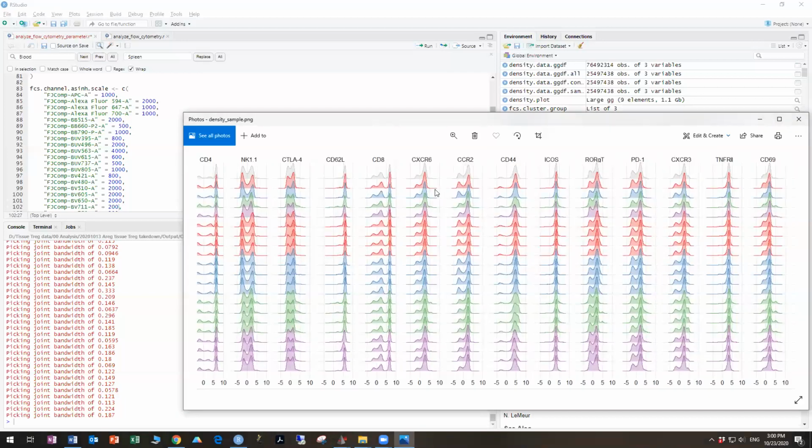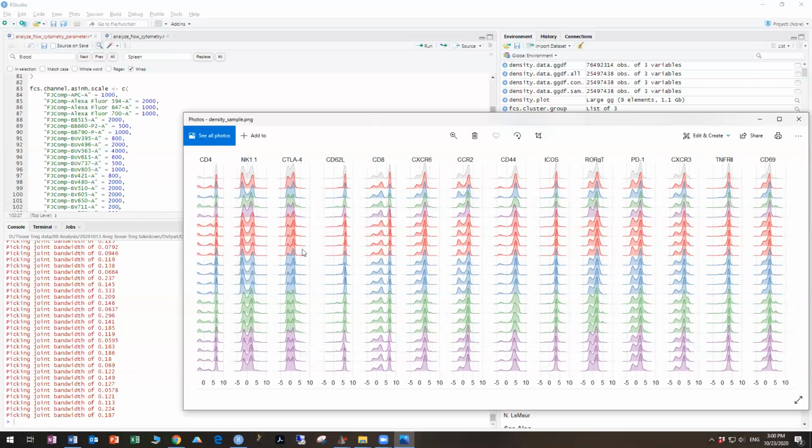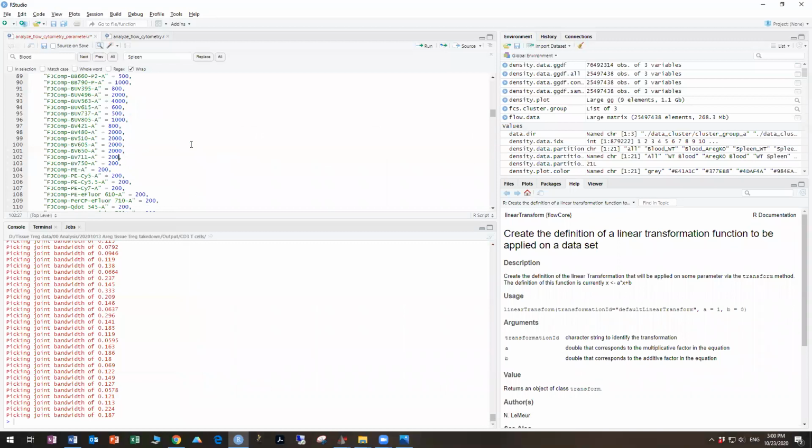And so what we're trying to do is not only eliminate spreading that's causing trimodal populations, but also false negatives. And so if you look in FlowJo, you'll see that there isn't this tail of ICOS super negative cells. That's really probably just either spreading in compensation or unmixing error that really should just be grouped in with the negative. So by increasing the compression, we can bring that up into the negative population and ignore it.